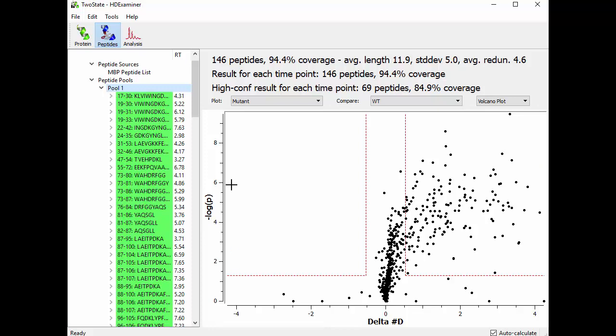The Y axis here is the negative log of the P value that you got by looking at the replicate data. So this difference here has a P value of 5.863 times 10 to the minus 7. So it's a pretty low P value.